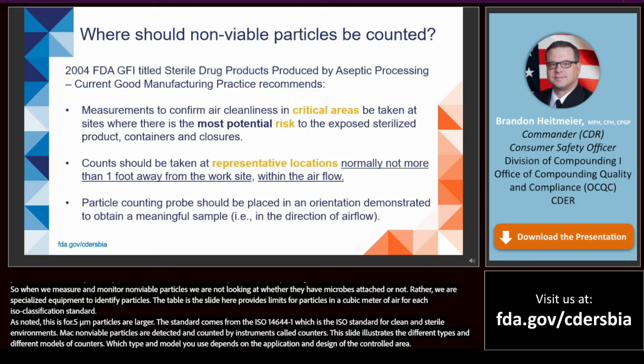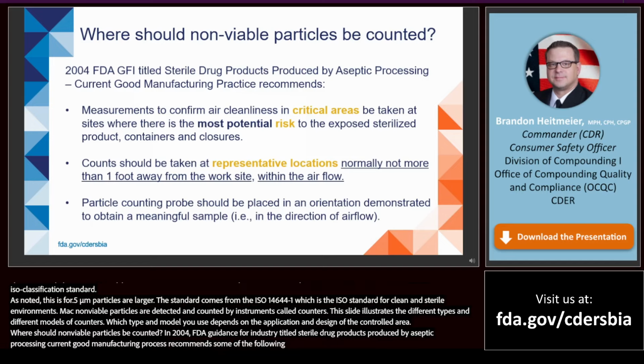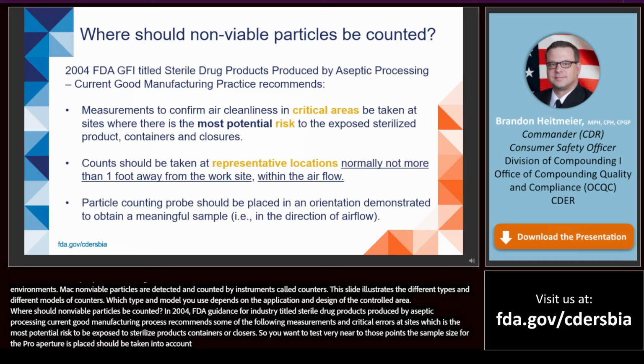Where should non-viable particles be counted? Well, the 2004 FDA Guidance for Industry, titled Sterile Drug Products Produced by Aseptic Processing, Current Good Manufacturing Practice, recommends some of the following. Measurements in critical areas at sites where there is the most potential risk to be exposed to sterilized products or containers or closures. So you want to test very near to those points. The sample site, in other words, where the probe aperture is placed, should be taken into account, and that the location is representative of the operations.